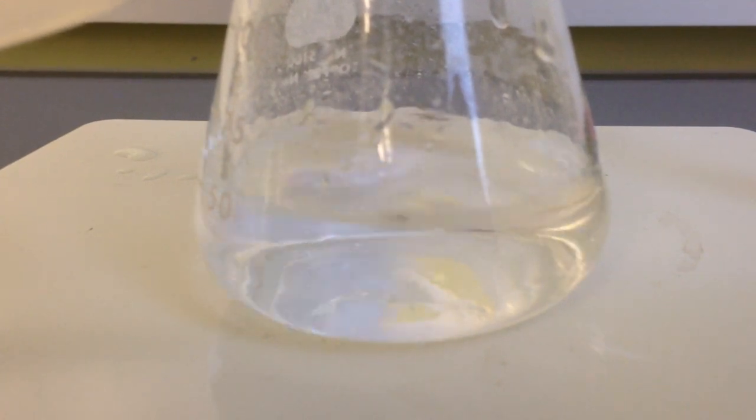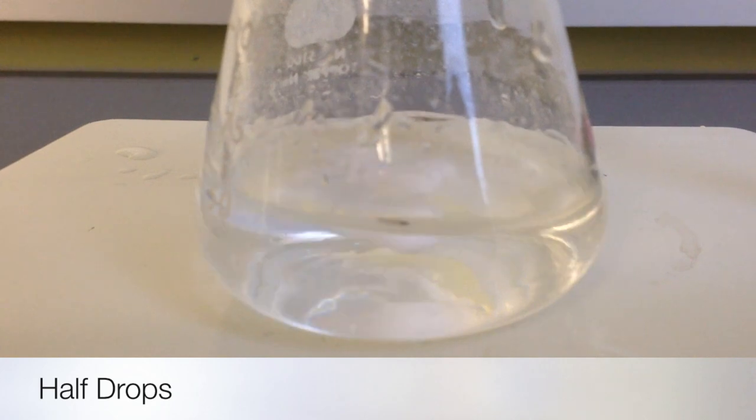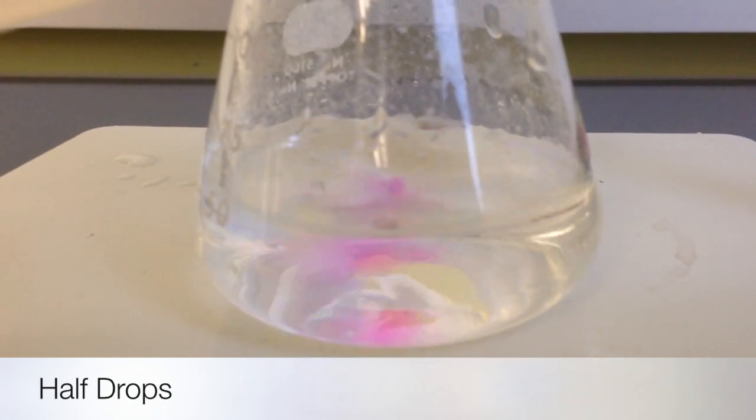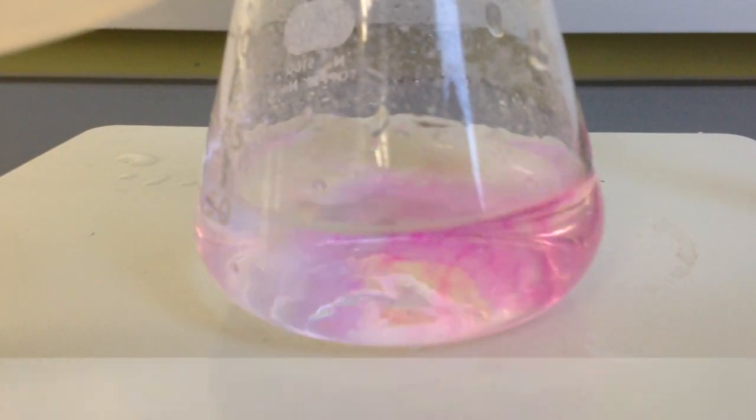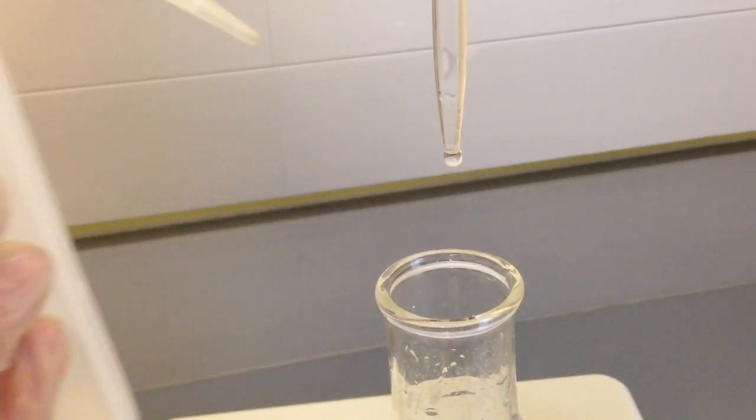Once the sample is very near the endpoint and indicator lasting for about 5 seconds, half drops come in handy. These are useful because of their precision and minimize over titrating the sample. To release half a drop, carefully open the stopcock just enough to form half a droplet, then quickly close the stopcock.